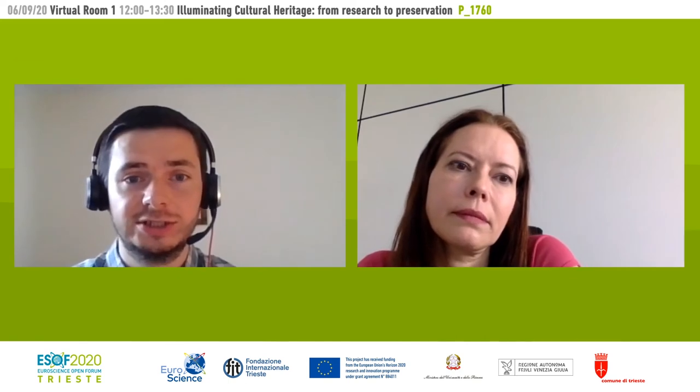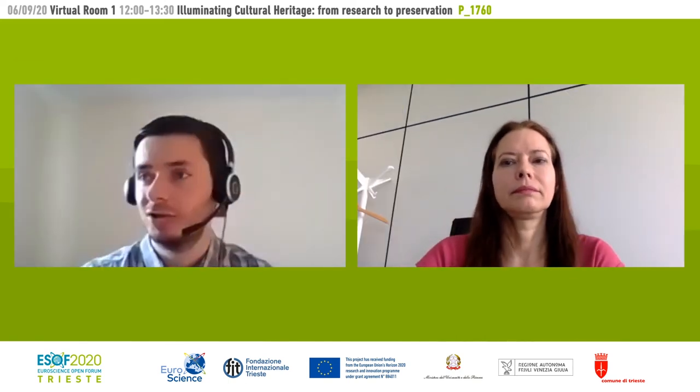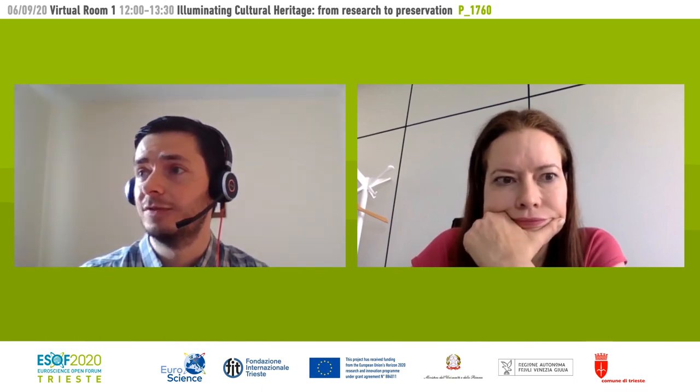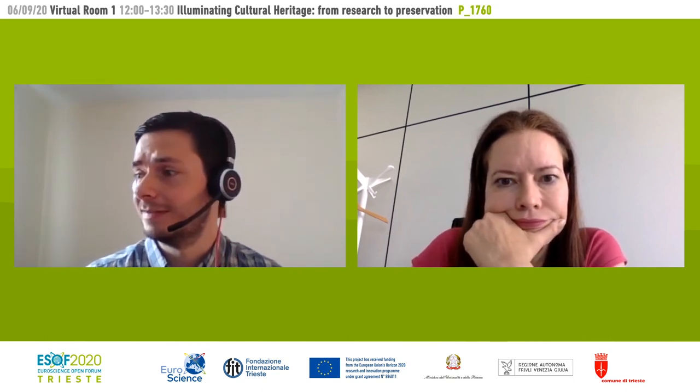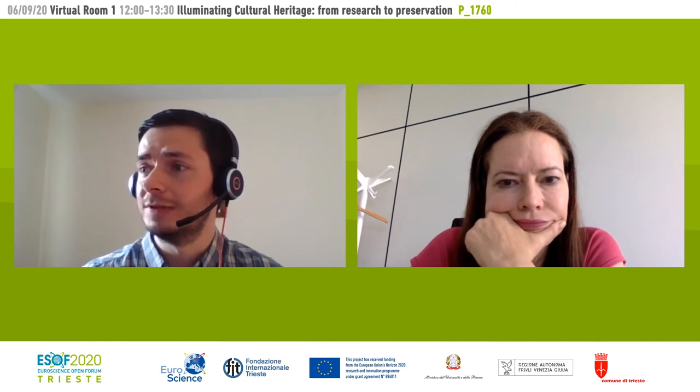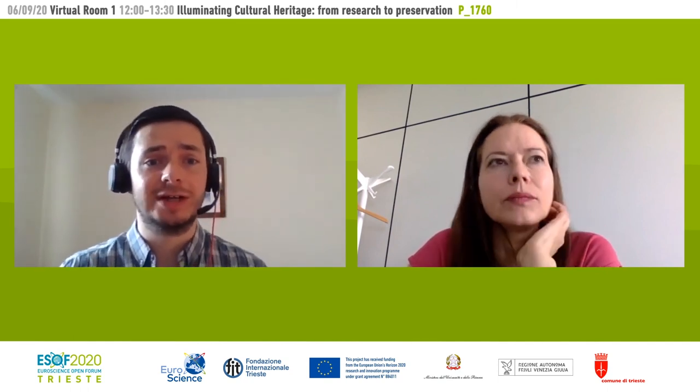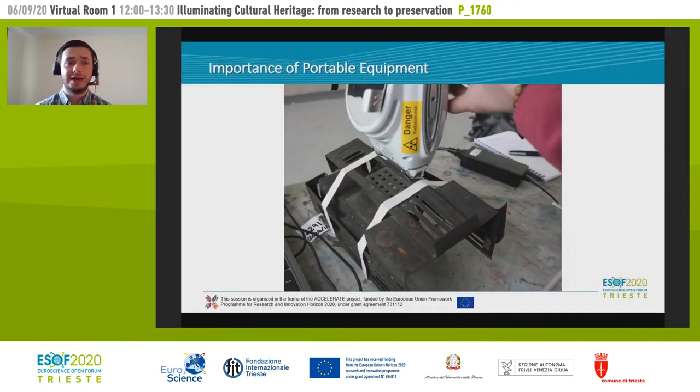I can quickly share my screen to give you an example of where this has been useful before. Portable equipment is invaluable. Not everything can be brought to the lab. Cultural heritage involves valuable materials that we're looking at. So again, having non-destructive and portable equipment is extremely important.